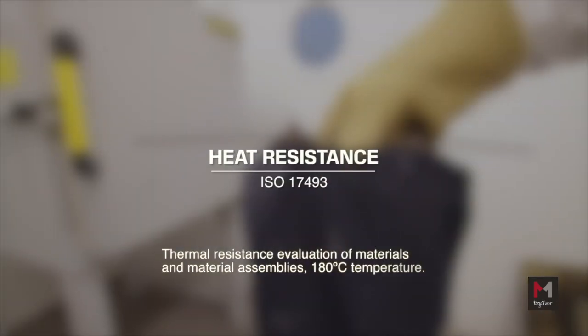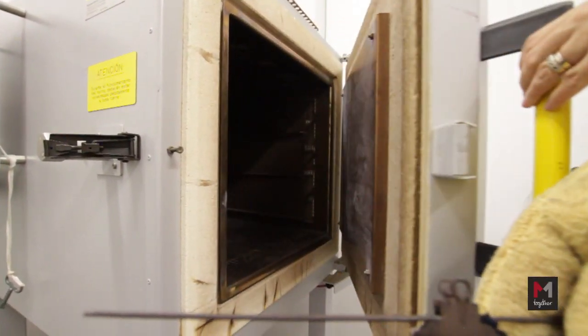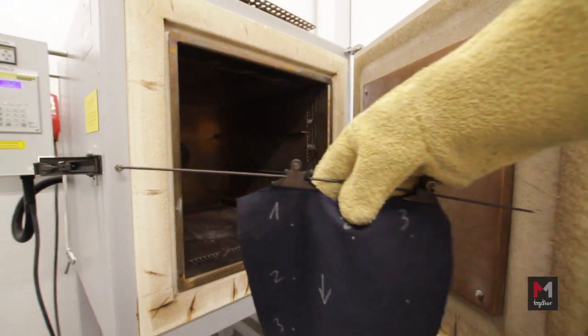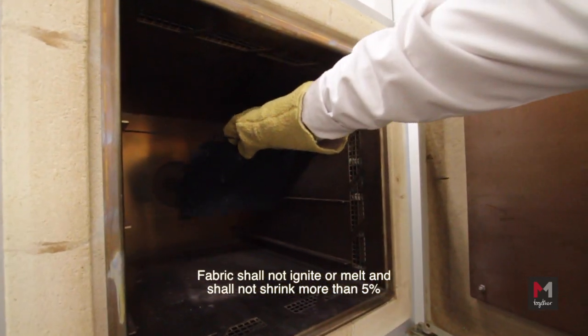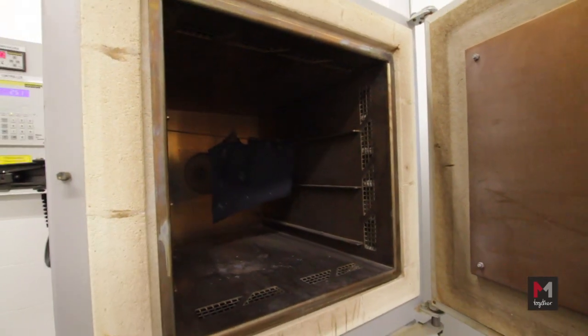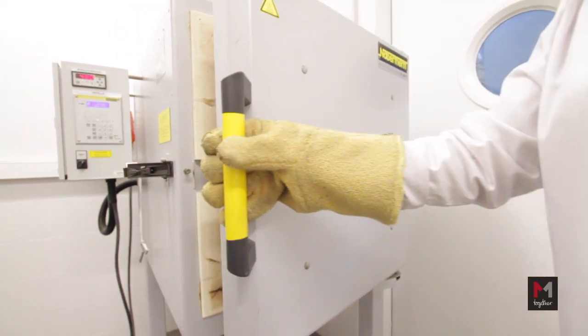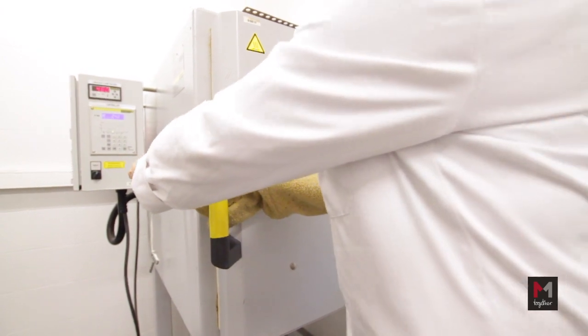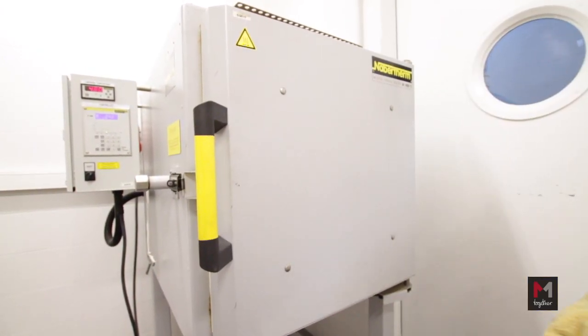Heat resistance at a temperature of 180 degrees Celsius: All fabrics and hardware used in the garment and/or clothing assembly shall not ignite or melt and shall not shrink more than 5%. Sample size is 50 centimeters by 50 centimeters. The test time is 5 minutes. An optional test at a temperature of 260 degrees Celsius can be done as well.